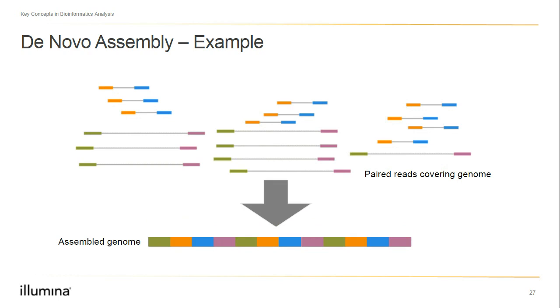I do want to clarify that this is a very simplistic model just for example purposes. To get a genome assembled into a continuous FASTA, it's really important that you consider the literature available and abide by the specific parameters used to get the best results. And as previously mentioned, those may have to be revised in order to produce the best results.